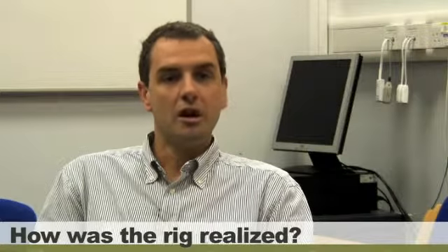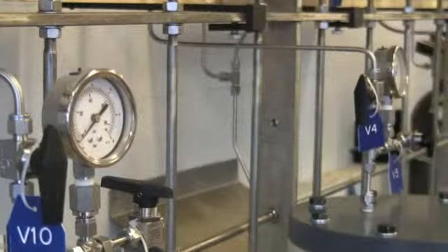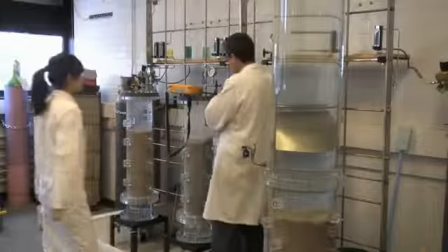This was quite challenging because we had to develop a totally new approach to the problem, and thanks to our workshop crew, they were able to physically make this rig. We had a lot of troubles to solve because there is water inside, there is high pressure somewhere, and there are potentially toxic gases. So even the safety issues were quite challenging. But finally, we had this rig that is working very well, and we hope to develop further experiments on this same equipment.